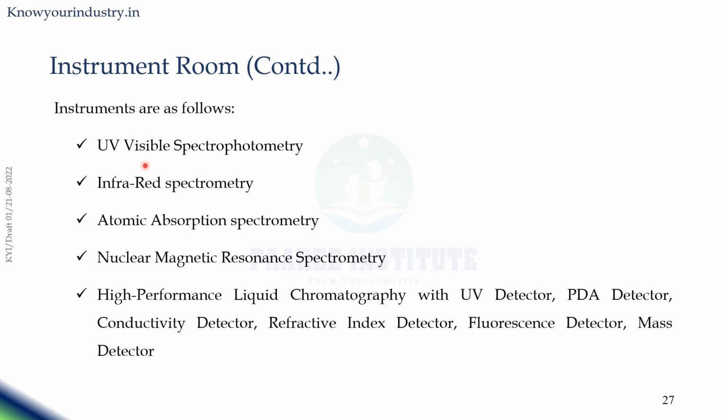For example, the instrument room will have UV spectrophotometry, infrared spectrophotometry, atomic absorption spectrophotometric instrument, NMR, high performance liquid chromatography with UV detector, PDA detector, HPLC instruments with refractive index detectors, fluorescent detectors, mass detectors.